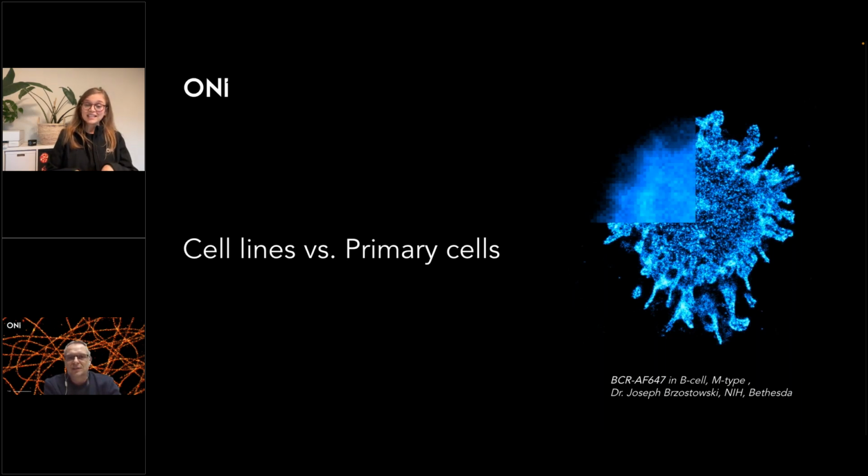So these are the options. It's possible, but it can be a little bit tricky with the signal to noise ratio. We have to be very sure about using maybe a thin layer of collagen or PLL. Usually a thin layer of collagen or PLL is the right solution here. But as I said, you can also use activated surfaces.